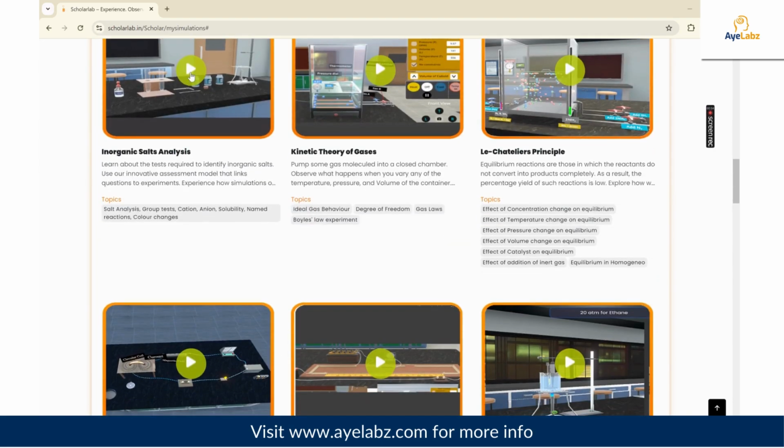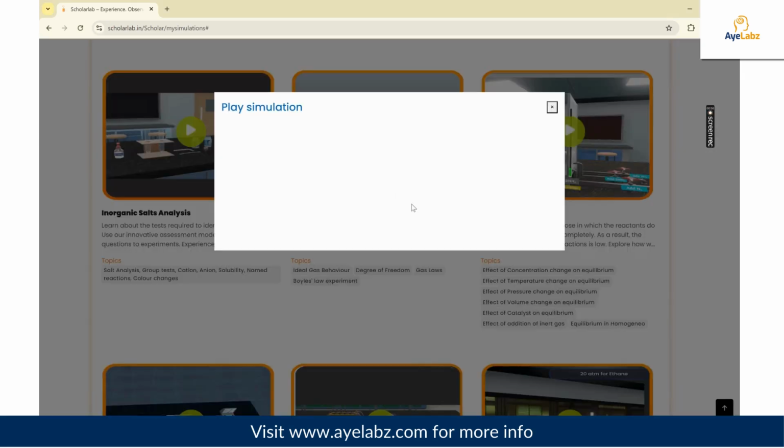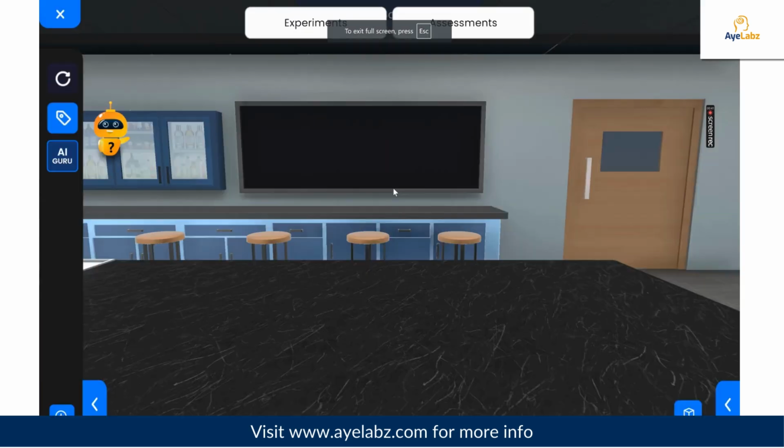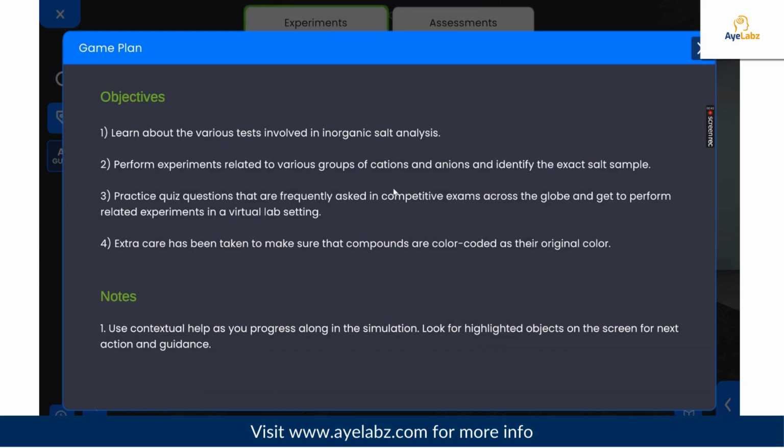Let me open the inorganic salt analysis simulation for you. Each simulation begins with the game plan. This outlines the overall objective of the simulation. Our main objective is to test the various salt analysis processes.